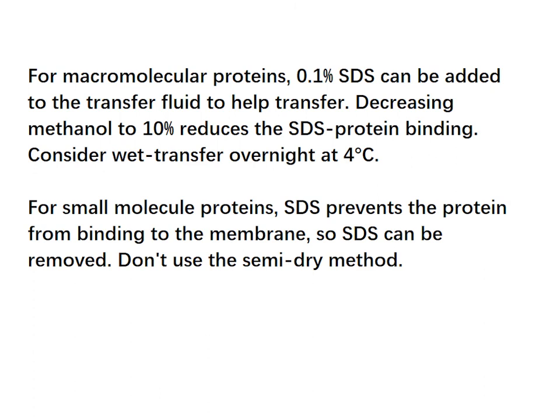For macromolecular proteins, 0.1% SDS can be added to the transfer fluid to help transfer. Decrease methanol to 10%. Consider wet transfer overnight at 4 degrees Celsius. For small molecular proteins, SDS prevents the protein from binding to the membrane, so SDS can be removed.